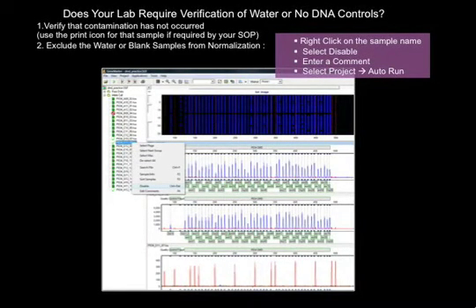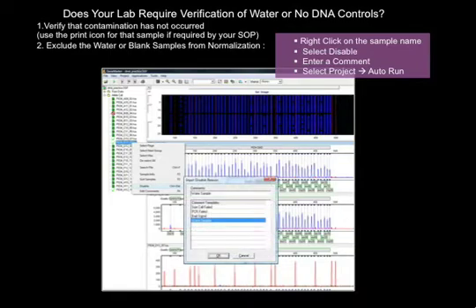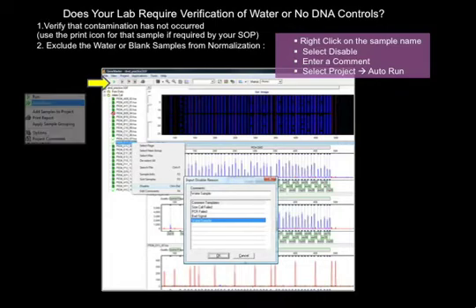Many lab SOPs include water controls to check for contamination. After verifying the integrity of a water control, these samples should be disabled so that they do not skew results. Simply right-click on the water control sample, select Disable, and input a comment. Then select Project and Autorun.